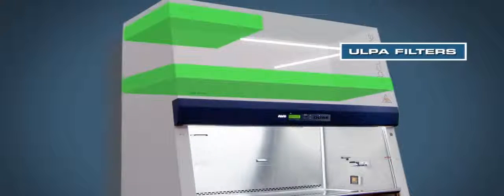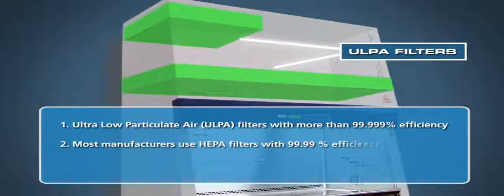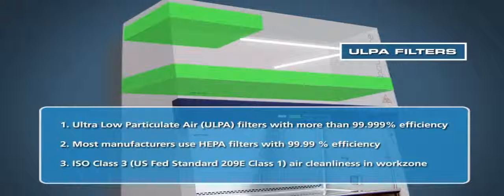The LabCulture Class II Type A2 Biosafety Cabinet uses the latest design ultra-low particulate air, or ULPA, filters with a typical efficiency of more than 99.999% for particulate sizes of 0.12 microns to 0.3 microns. ULPA filters are able to provide 10 times better filtration compared to conventional HEPA filters offered by other manufacturers. As a result, LabCulture cabinets are able to provide a work zone cleanliness level of ISO Class III.